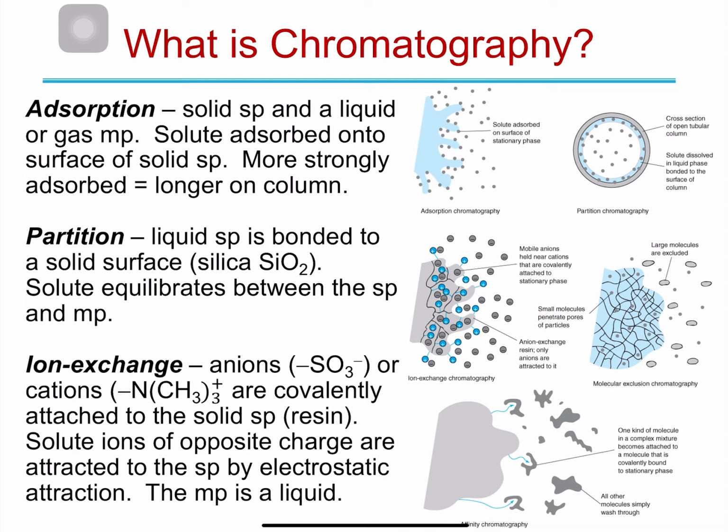So, what are the different principles for the operation of chromatography? What type of affinity are we talking about? And based on this affinity, how can we separate the different components in any sample? So, there are five main principles for this separation. The first one is adsorption.